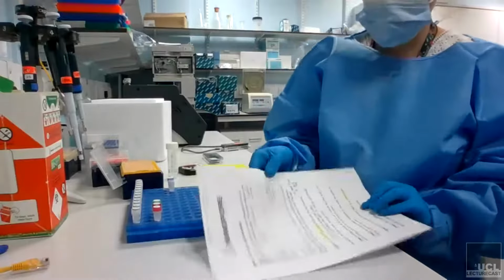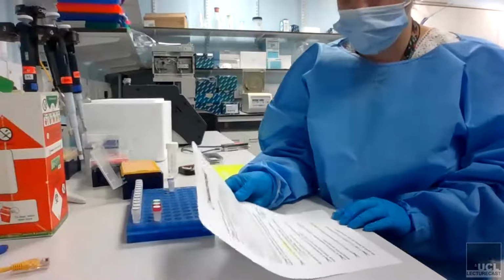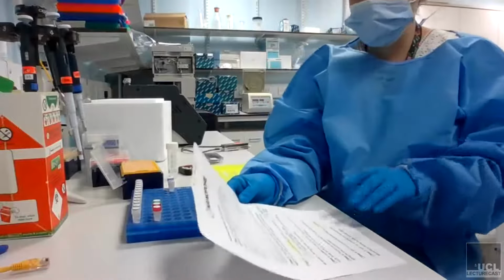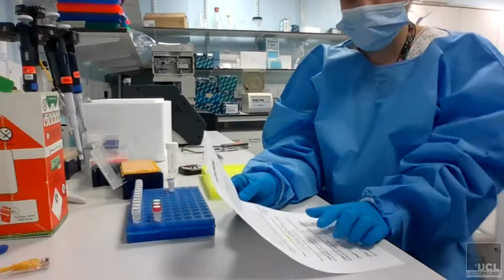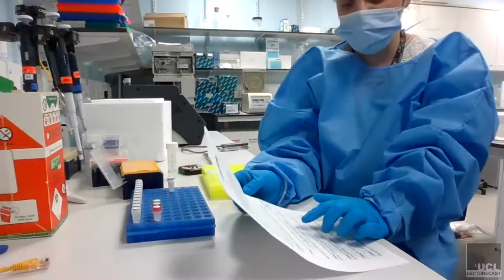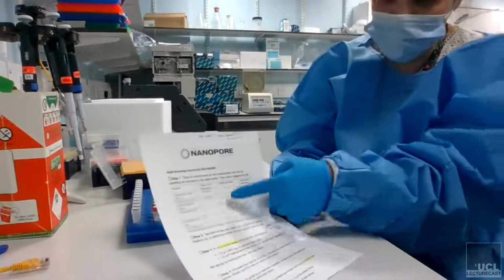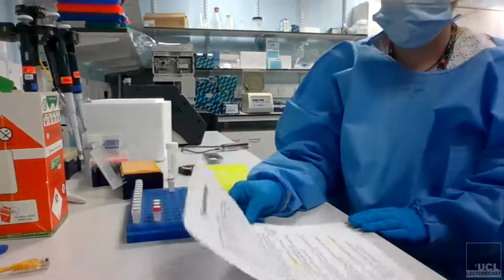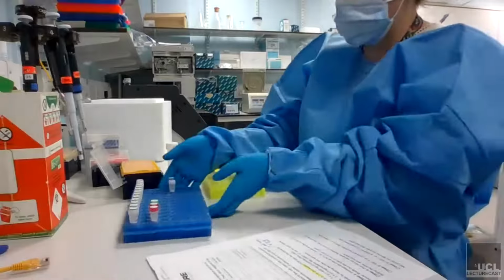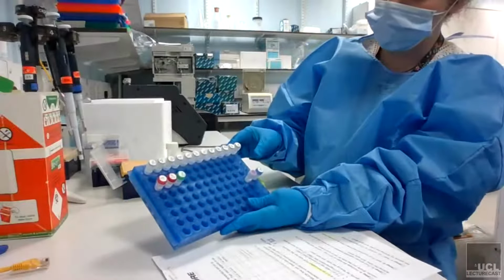But what I'm following is the Oxford Nanopore's protocol. This is on their website, if you go on their community channel. This is their very basic one, so it's the test, the control one. It says to use lambda DNA, which is their control DNA. But it's quite good because it covers what to do with all of the reagents. And to start with, these are all of the reagents that we're going to use today.